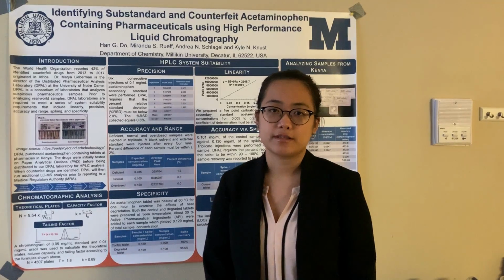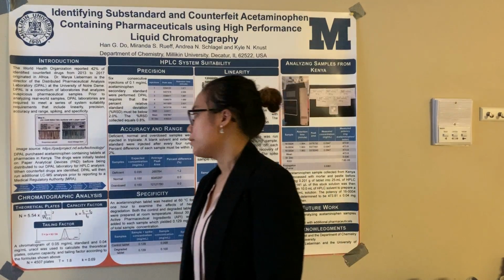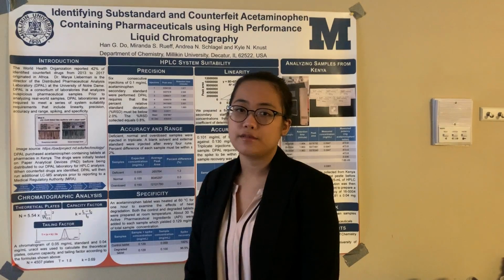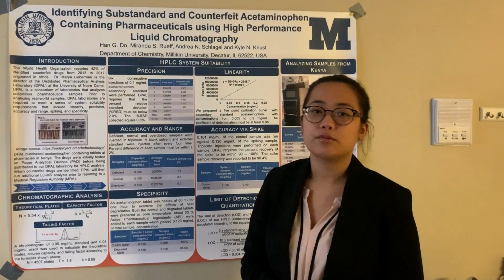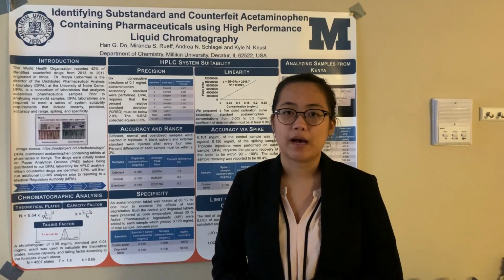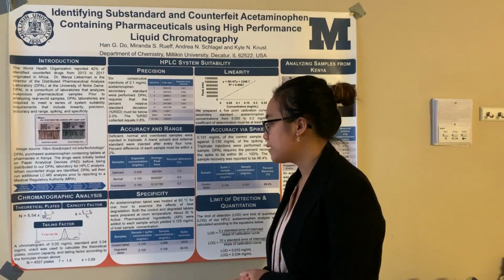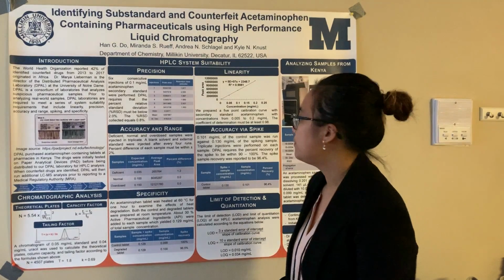DPAL personnel will purchase the pharmaceutical samples in Africa, and they will swipe the samples across a paper analytical device that looks similar to this. A suspicious sample will have color variations that look different from a good dosage form. That drug sample will be sent to DPAL, and DPAL will distribute the samples to the DPAL participant laboratories for further analysis. Here is a series that I used to calculate our instrument's theoretical plates, capacity factor, and tailing factors.